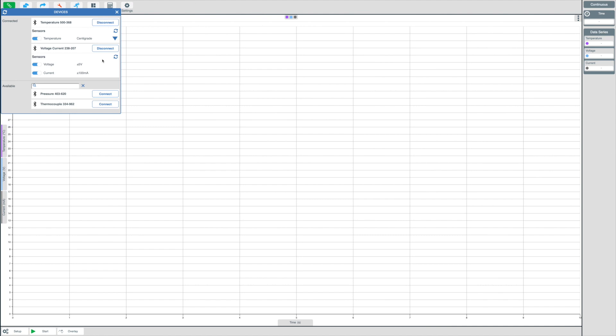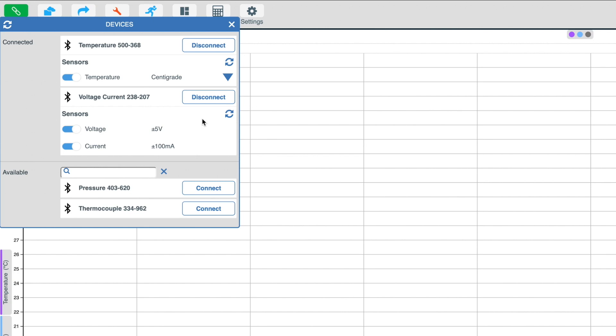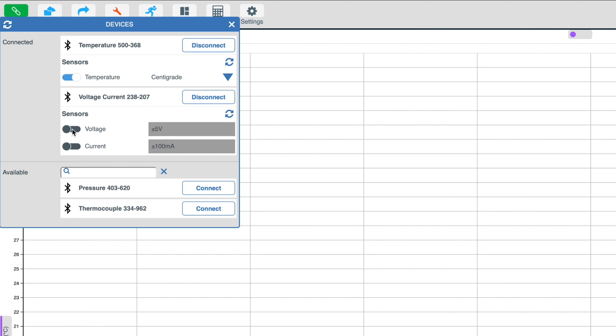As previously mentioned about devices and their number of internal sensors, we can see here that the temperature sensor has one internal sensor and the voltage current has two internal sensors. You can disable and enable these sensors as you wish, simply by clicking on the slider to the left of the sensor's name.